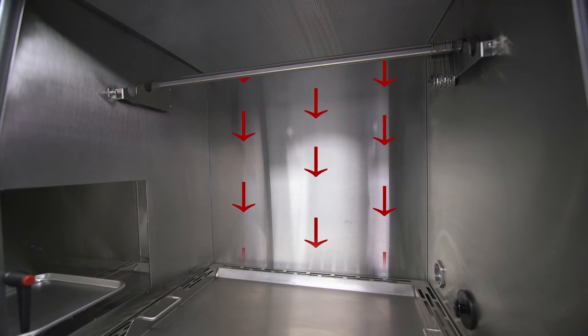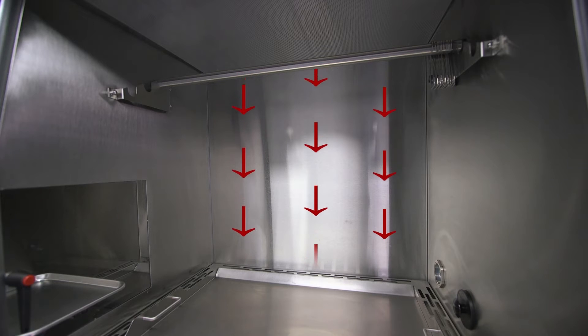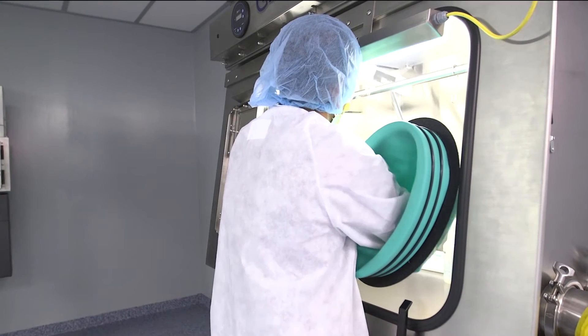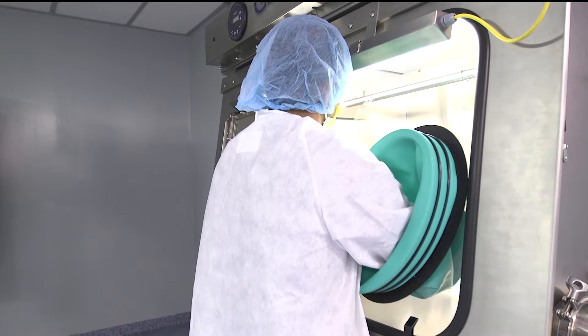pollen, and droplets that can harbor spores, bacteria, and viruses. This downdraft of clean air flows from top to bottom and prevents airborne particulates from building up, minimizes the likelihood of cross-contamination, and provides the highest level of protection possible.